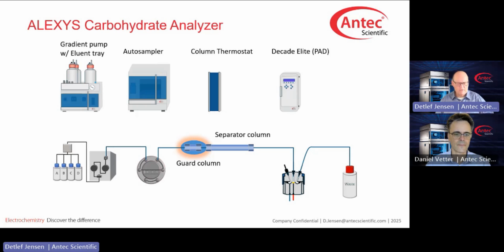The question that we have to answer now is, how do we find out when to either rinse or exchange the guard column? Because it is clear that if you knowingly foul the guard column, you will have to live with decreasing retention times. Now, retention times is the key word.